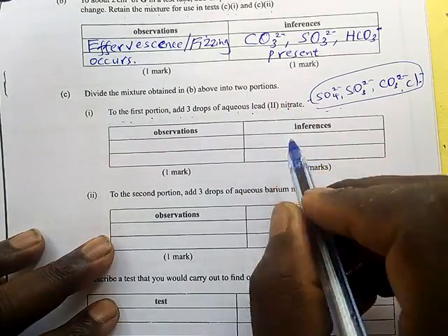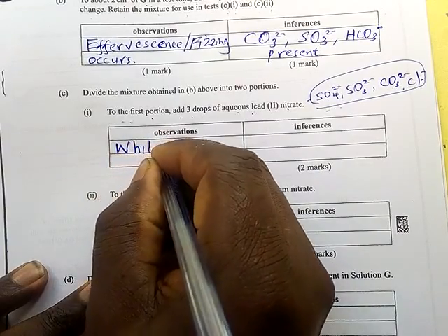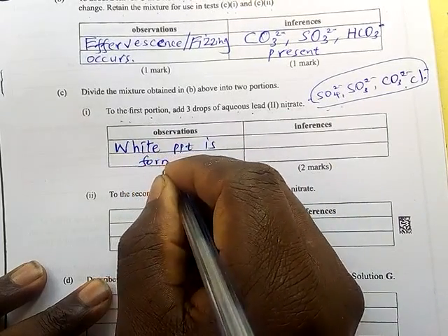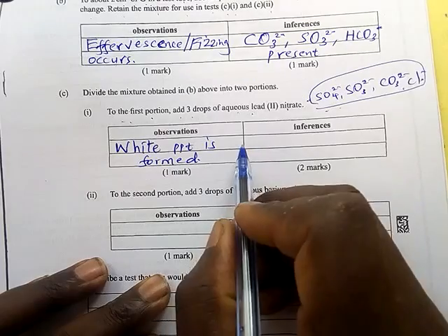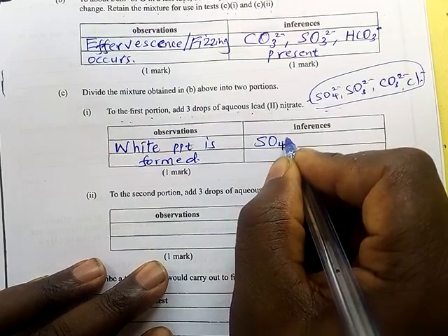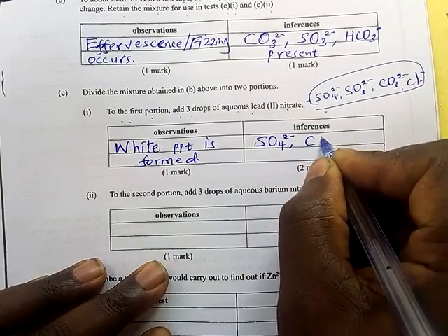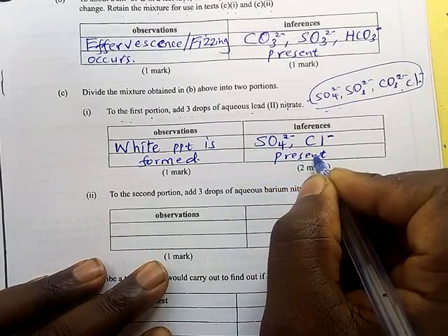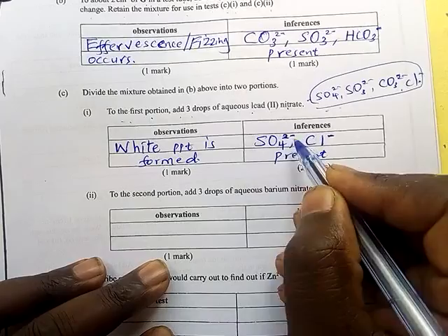So you need to know that all of these ions will form a white precipitate with lead. So you need to be sure. So what was the observation here? The observation is that a white precipitate is formed. A white precipitate is formed. So the answer here is the sulfate and the chloride present. The sulfate ions and the chloride ions present.